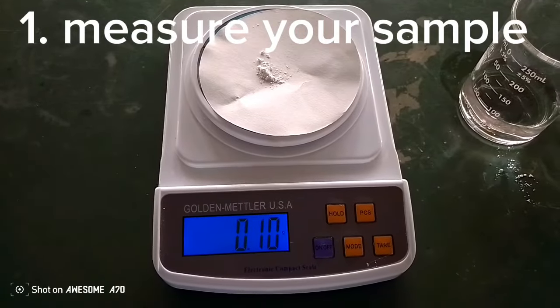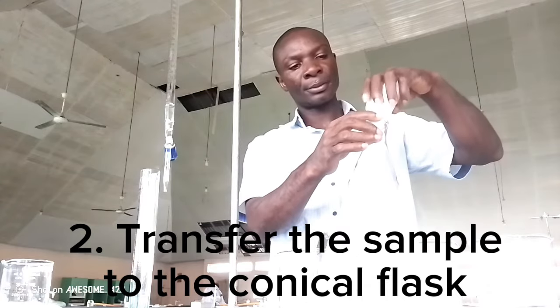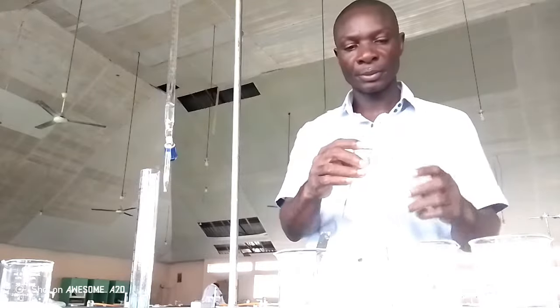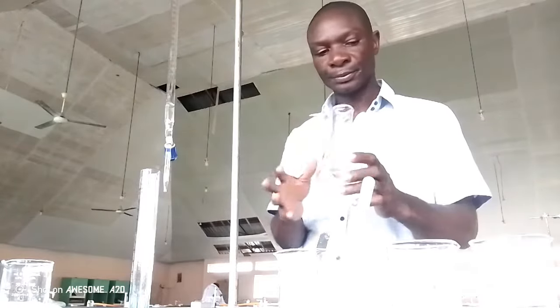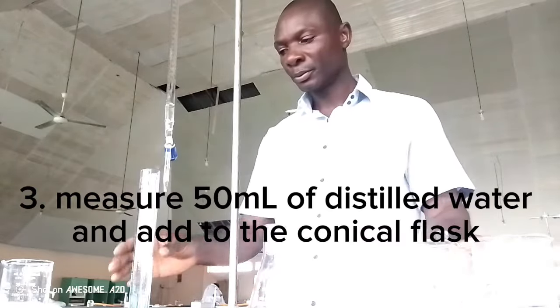1. Measure your sample. 2. Transfer the sample to the conical flask. 3.